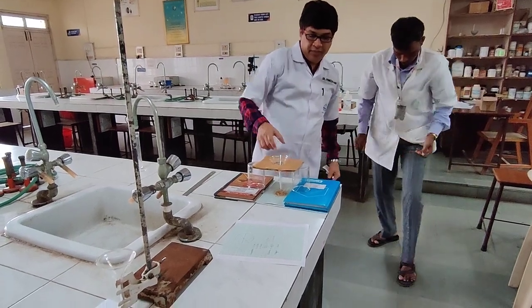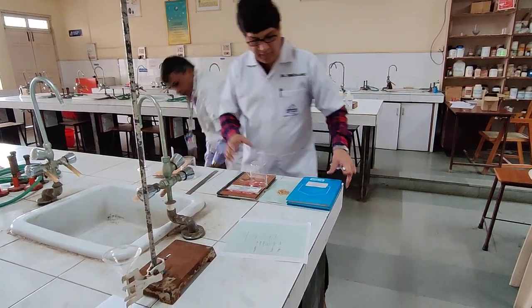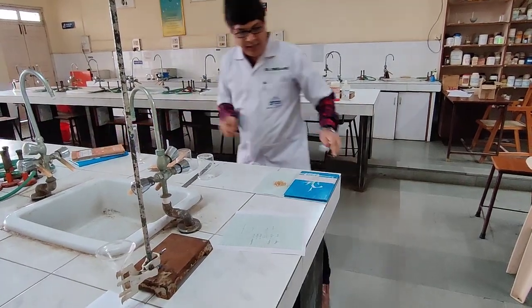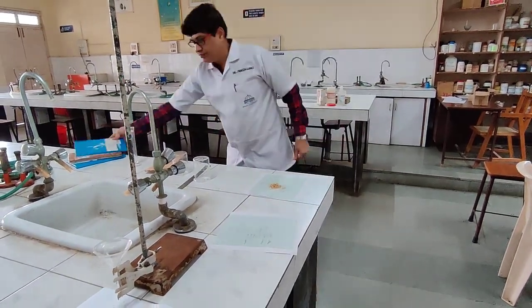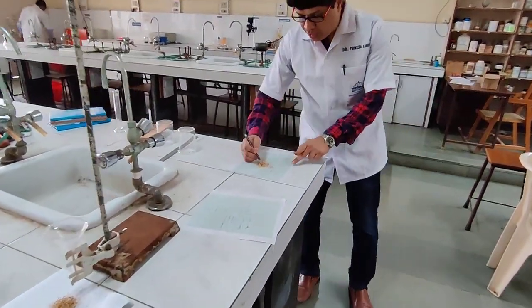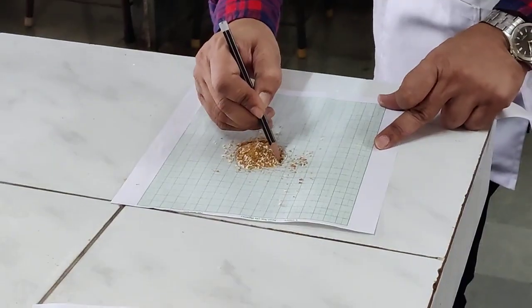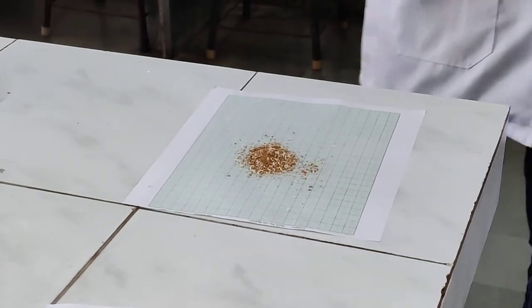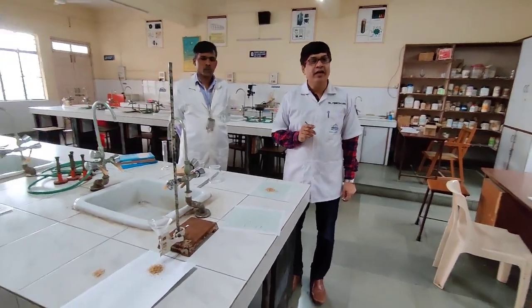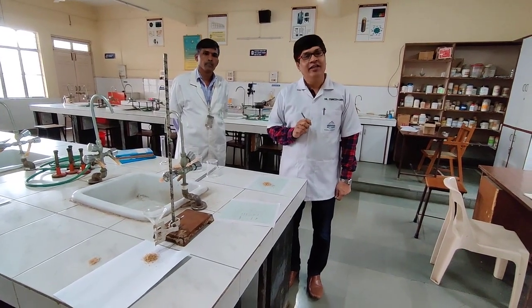You can see over here the heap has been formed. You can then remove the assembly. And then you can use the same methodology. And then you can use your pencil and you can draw the circle. So this is how you are going to calculate angle of repose, in the lab as well as at home. And you are going to find out the flow property of granules. Thank you very much.